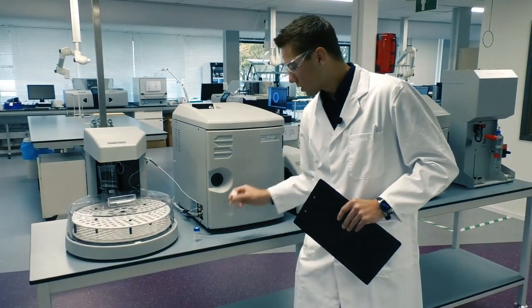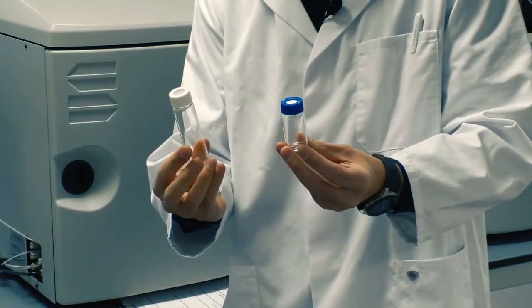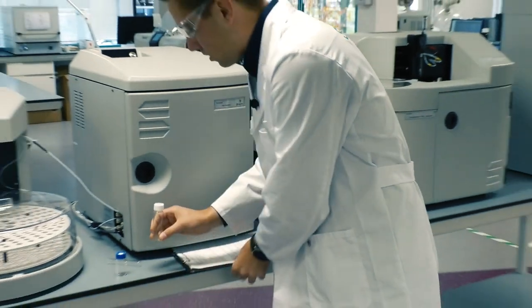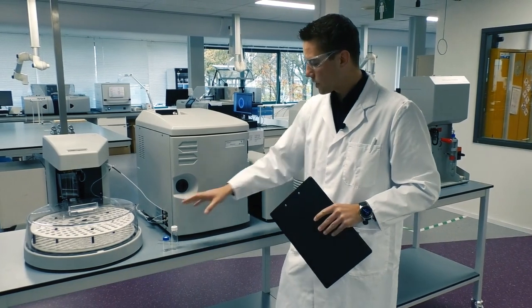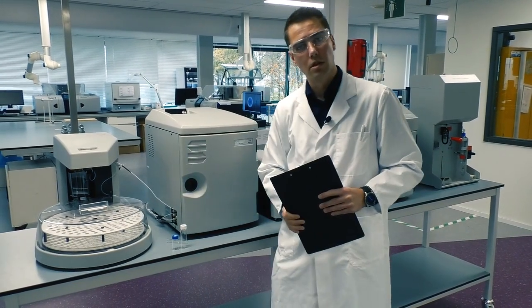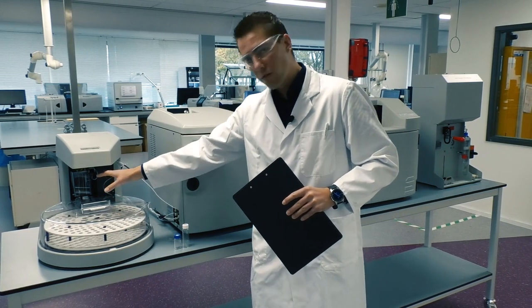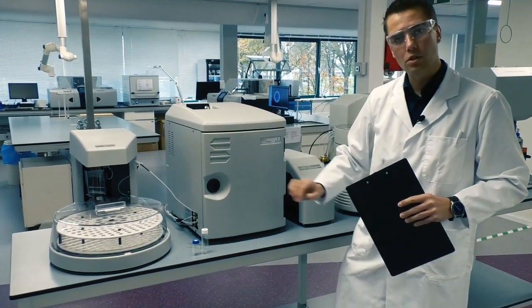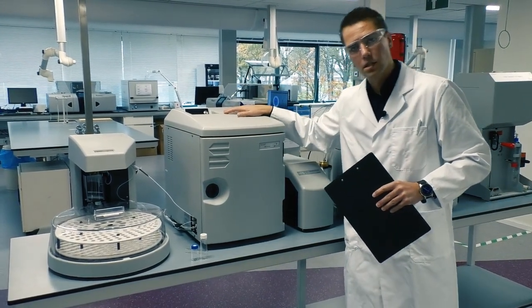but we can also equip the instrument with closed cups, for instance 20 ml or 40 ml septum sealed vials, and for that we will need a magnetic stirrer. The sample introduction is done via the sampler on the side of it. The sample is transported through tubing into the instrument and then into the catalyst.